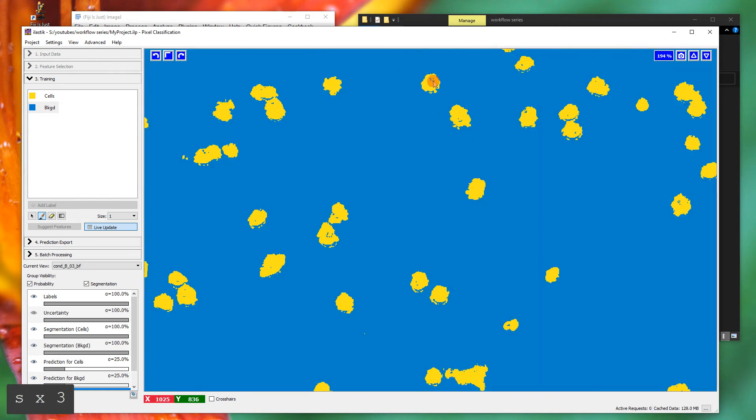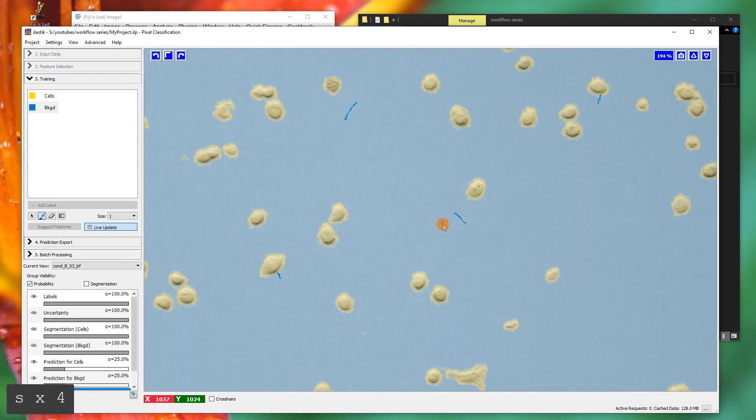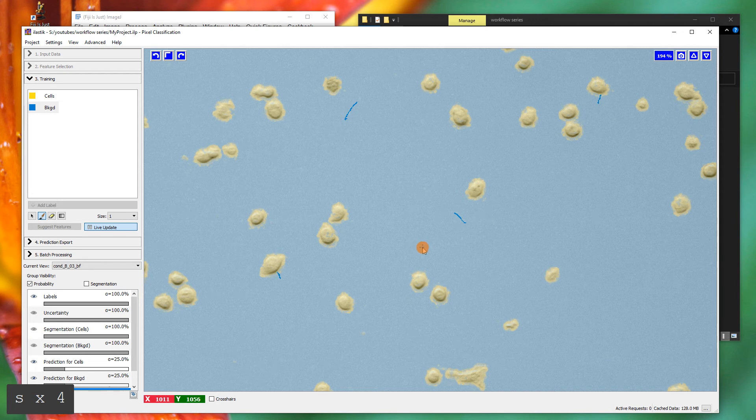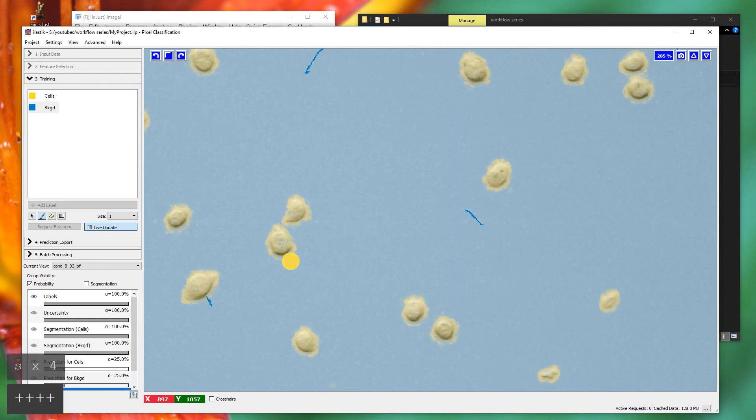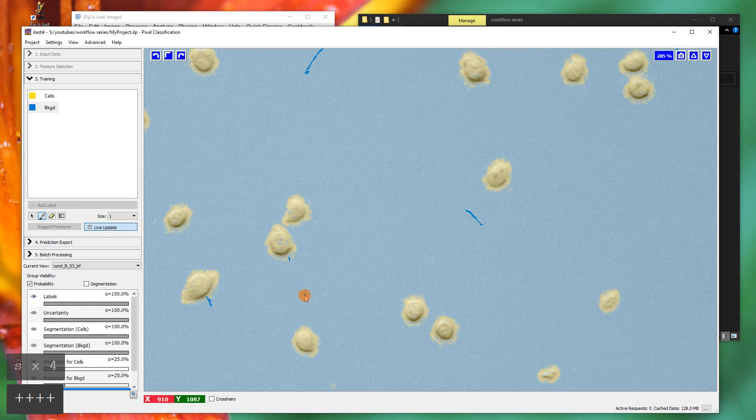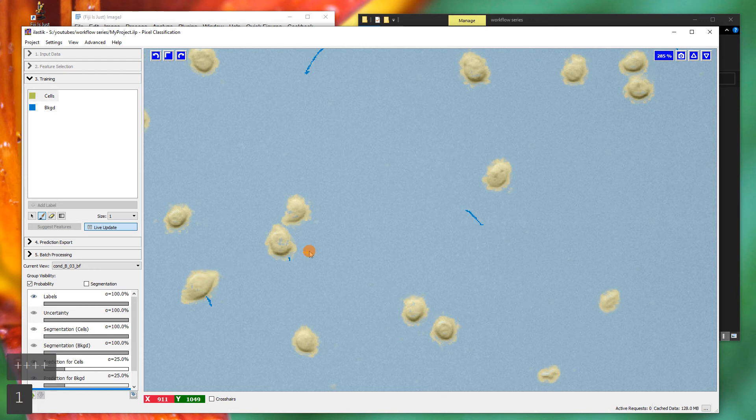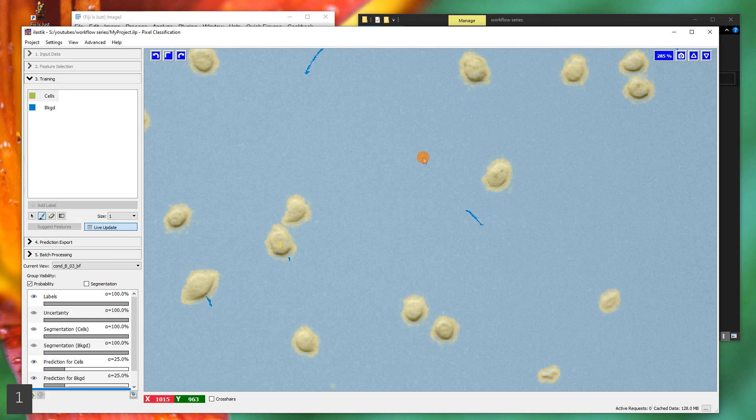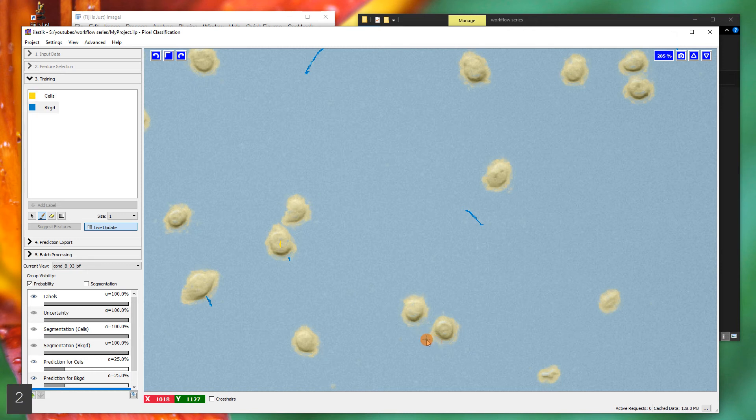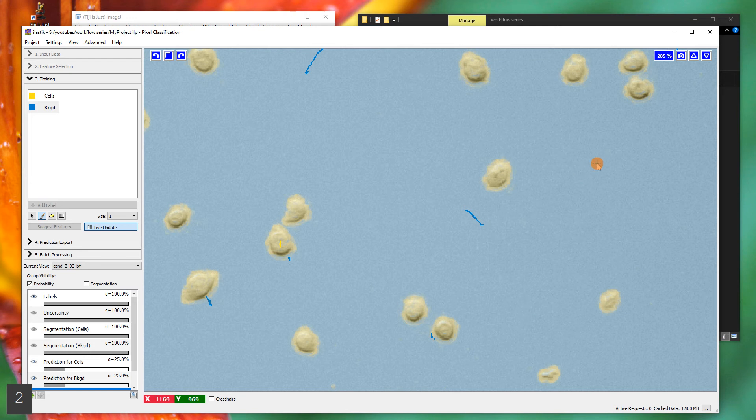With the texture on, it doesn't seem to eat in as much as before. When we go to CellProfiler, we're going to smooth out some of these bumps around the edges, smooth them out and make them slightly smaller. So really just aiming for mostly the bulk of the cell. Tiny little holes are okay, they will be filled in. That would probably be sufficient. You can tweak it a little bit more if you want to on a few little places. Try to keep things even as much as you can in each direction and have a few labels for cells, a few labels for background and vice versa and go back and forth. Make sure we have relatively even amount of each. We're going to run with that for the moment. I don't want to just keep tweaking, but sometimes you tweak too much and it doesn't really get that much better.